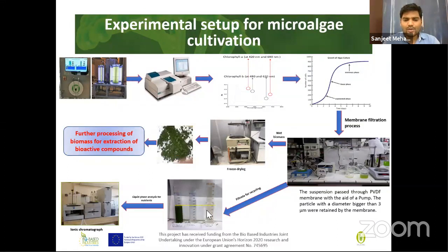In the filtrate, we analyzed the nutrient availability using ion chromatography to assess which nutrients are available, and the consumption efficiency during the growth phase. The wet biomass was lyophilized and had further processing for the extraction of bioactive compounds.